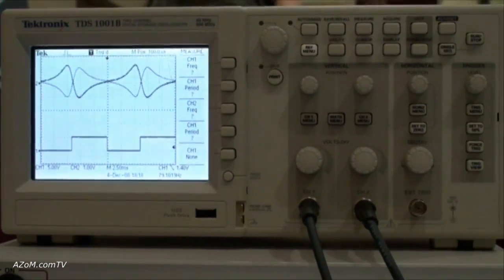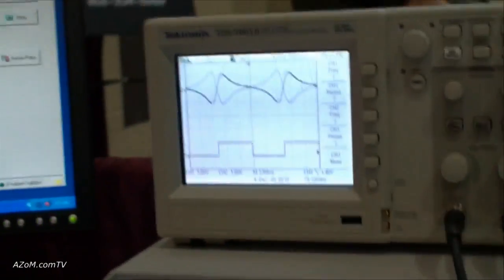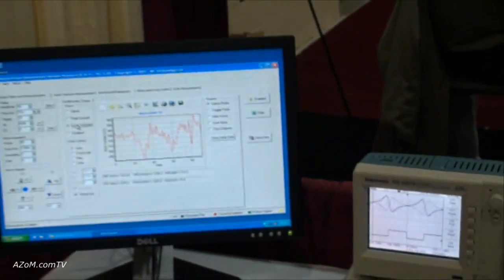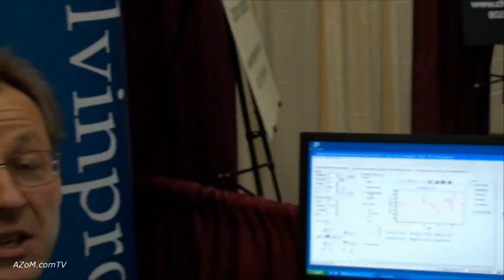It's a simple technique to use. I measured some customer samples yesterday, and the customer was astounded by how fast it was compared with atomic force microscopy Kelvin probe, which he was used to. It's a quick technique, very fast, with automatic setup.